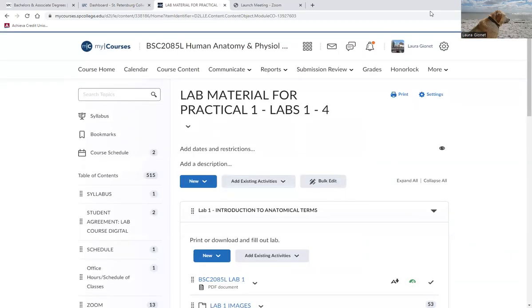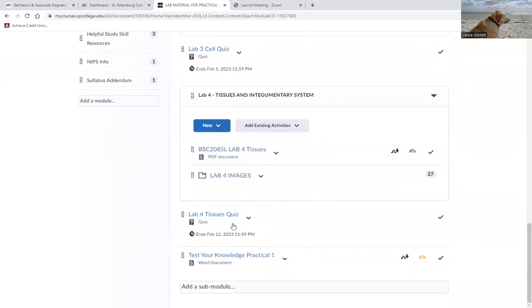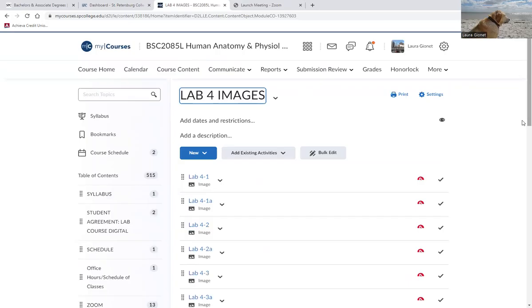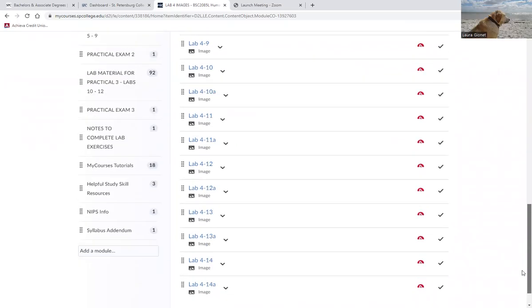And that's it. That is the end of the content. In your lab book, there are pictures of the microscopes, and they label those particular parts of the microscope that we mentioned before. I think previously there might have been a picture that was part of the lab images, and I don't know if it got removed for a particular reason and then never replaced. However, if you've purchased a lab book, it points to the different parts of the microscope.